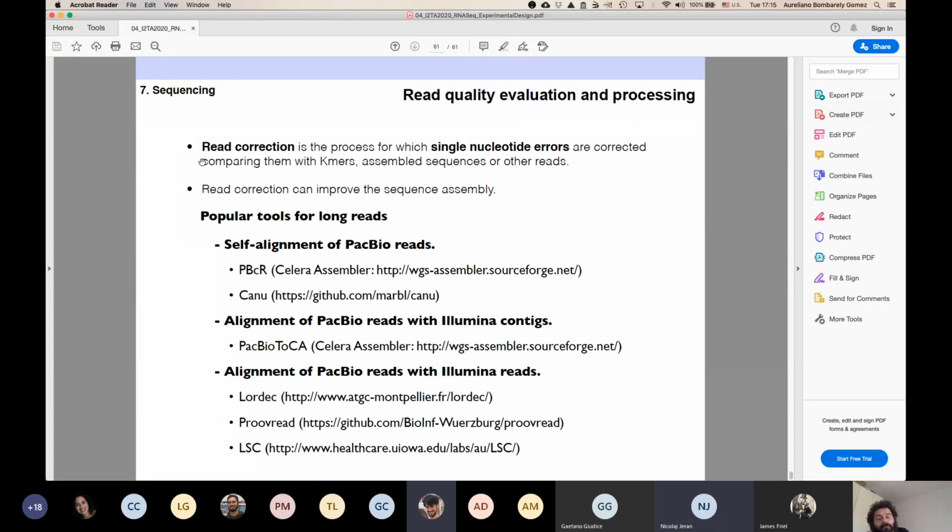Okay. Actually, can I just ask a quick question? Where do you find and how do you select references? We talked about this a bit, but I don't really know where I can find them. Oh, you go to a database and then you check if your genome of interest is there. Let's suppose that you are working with the human genome. In the human genome, the reference is going to be NCBI. So you can go to NCBI and download the latest version of the human genome, that is 38, I think. Mouse is the same thing. For mouse, the place is NCBI.